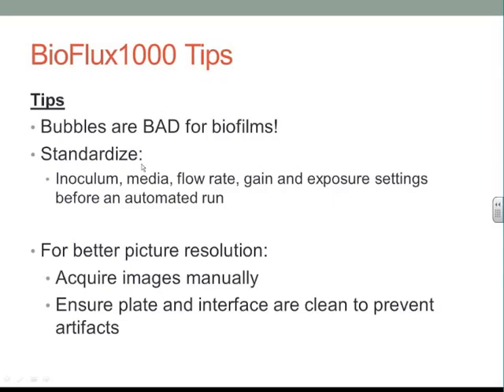Additionally, you need to standardize everything beforehand. I've used a particular medium because I standardized it for this particular strain and this particular species. Now, from what little experience I have with different species of bacteria growing in the system, you can get a lot of differences in growth, and you need to really standardize your media, your inoculum, and your flow rate. If you don't, you tend to get an overgrowth if you have too high of an inoculum. This actually clogs up your system, and then you don't get a very good biofilm. Or if you don't have enough inoculum to start with, then you tend to not get a very robust biofilm.